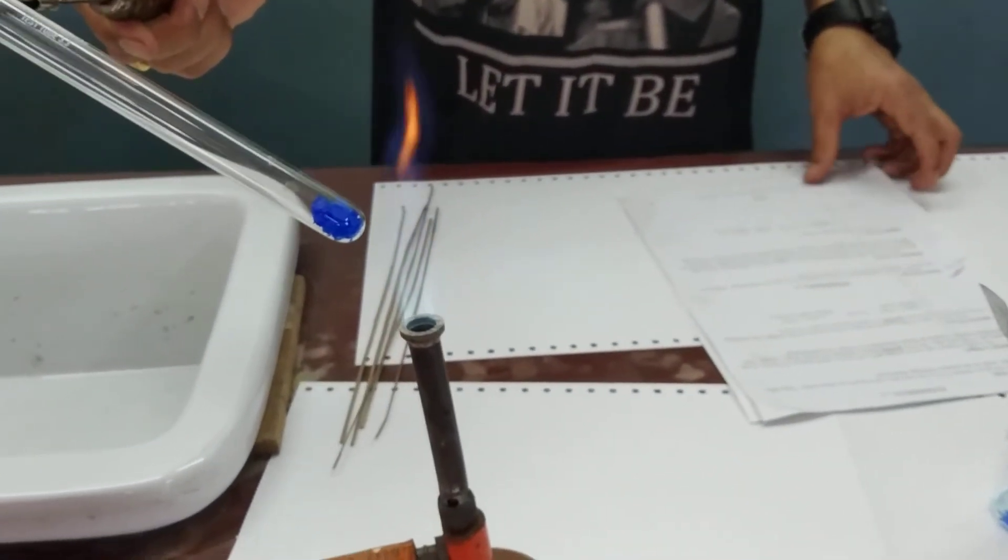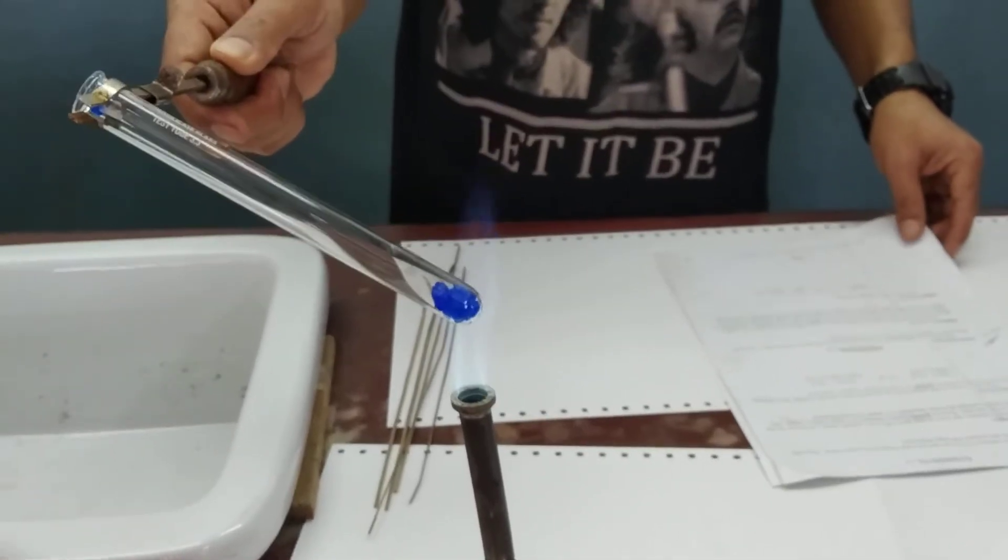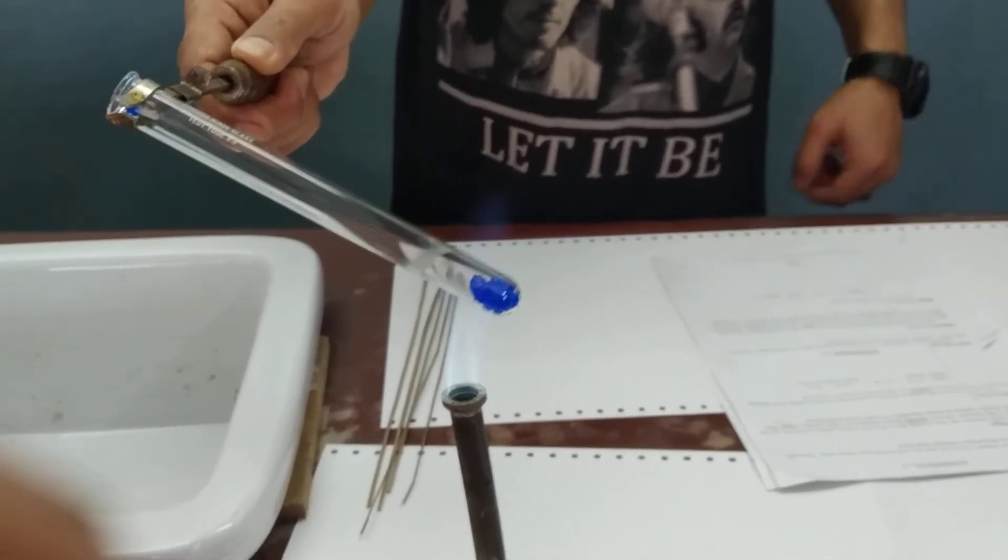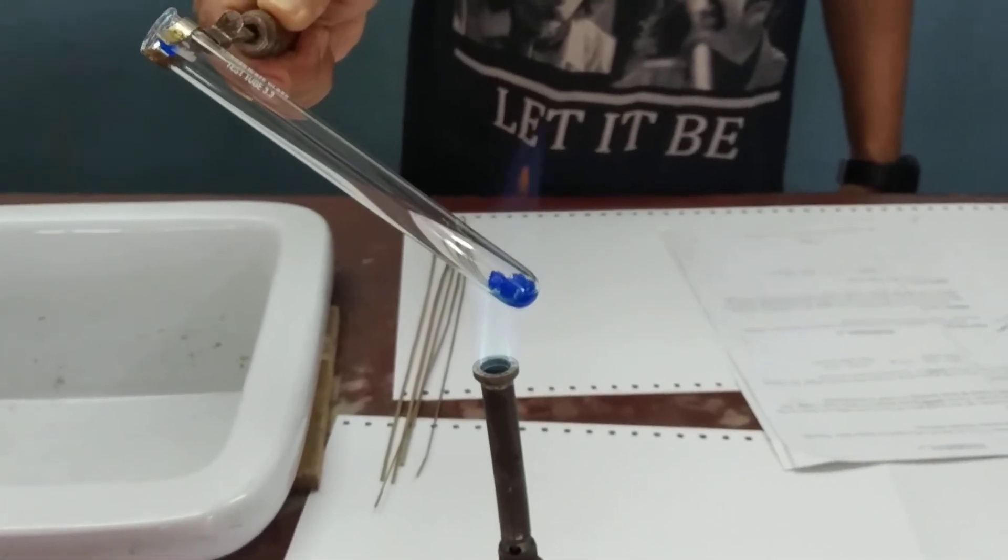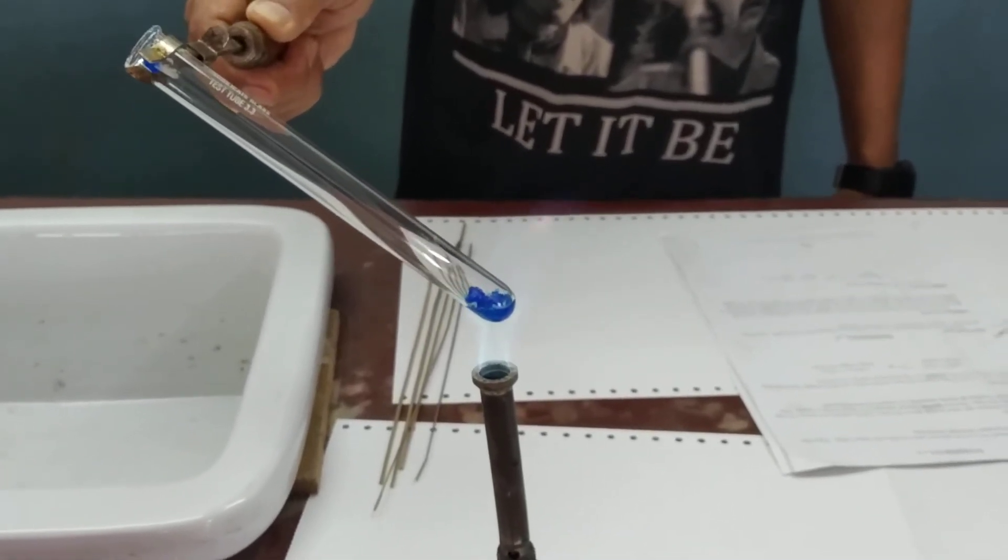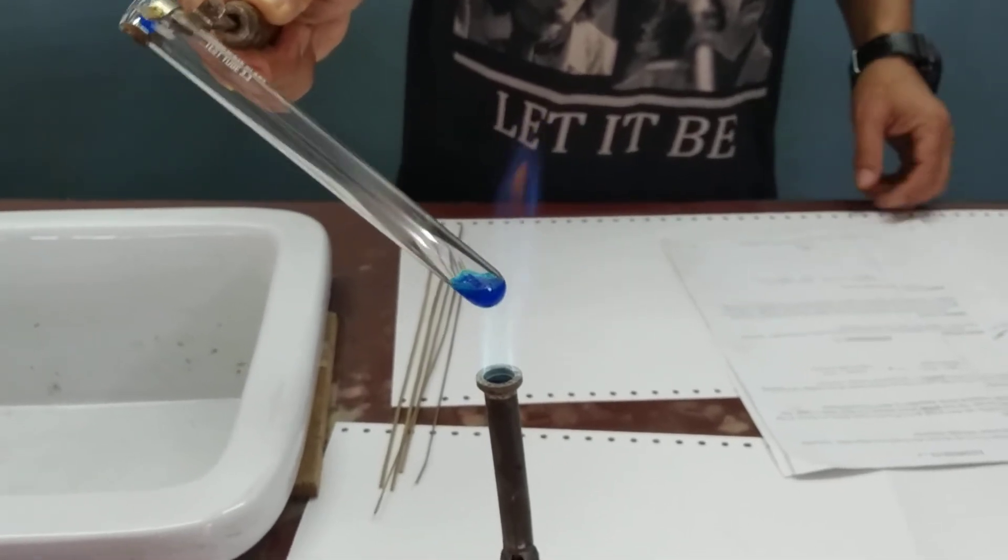We heat sample B in a dry test tube, similar to experiment number one. Record your observations, describe the residue, identify the product, and make deductions.